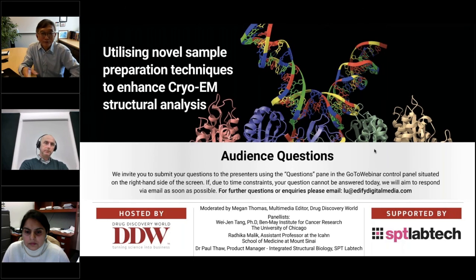If ATP is an important substrate, you can add it. That'll be good, and so forth, so that you can get through that layer.